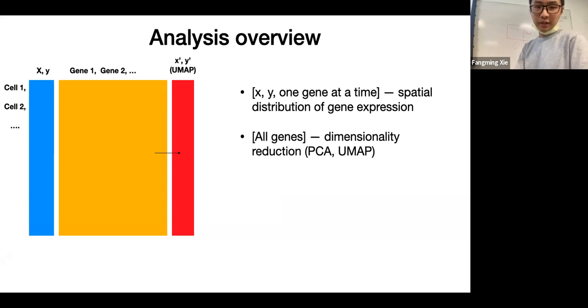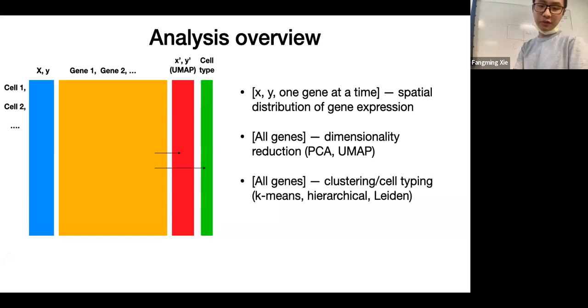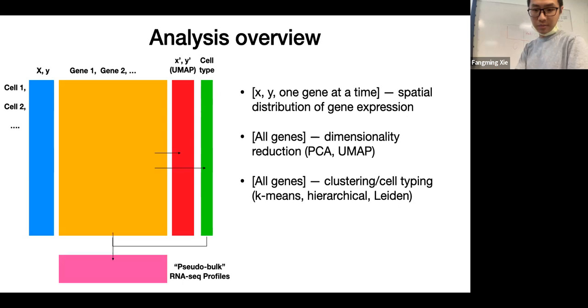That's one technique people often use even before spatial transcriptomics. And what else can we do? We know cells form types. Neurons are different from muscles, and neurons have subtypes. How do we identify their subtypes? According to their gene expression patterns. Then we can use the genes and gene features to cluster those cells. It's called clustering or cell typing. We'll talk about that a little bit today.